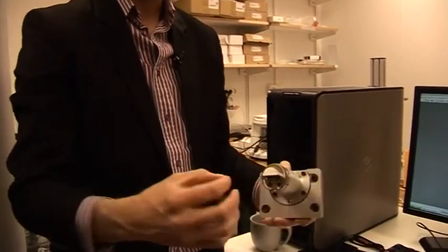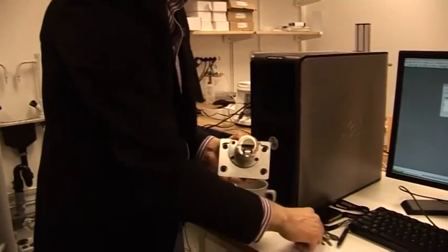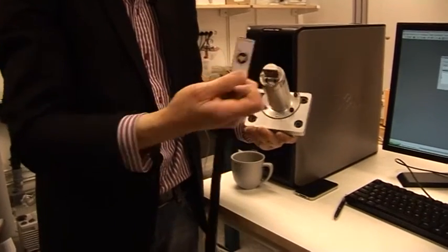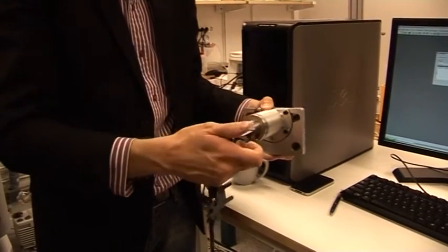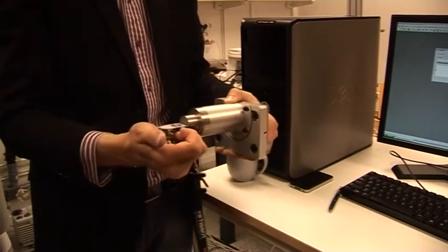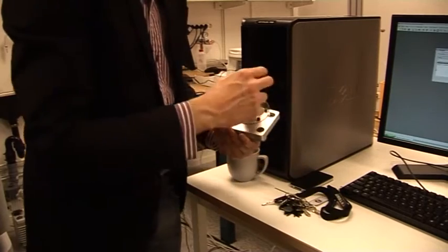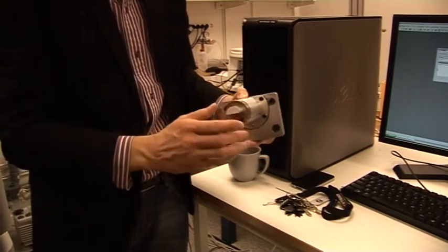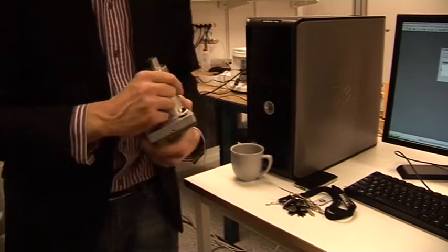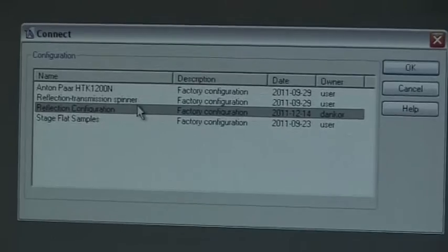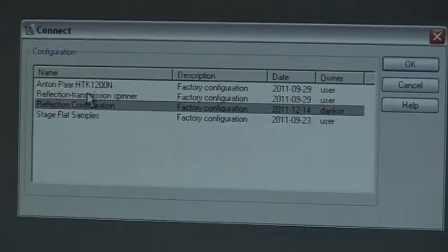You have to have quite a big sample that fits exactly here. If you have a sample that is looking like this, then it's kind of ideal to use this one. It's quite a simple sample stage but you need to have a sample that fits here nice. Then we have this other standard reflection transmission sample stages. These two are the same, slightly different configuration. It's exactly what we have now inserted.